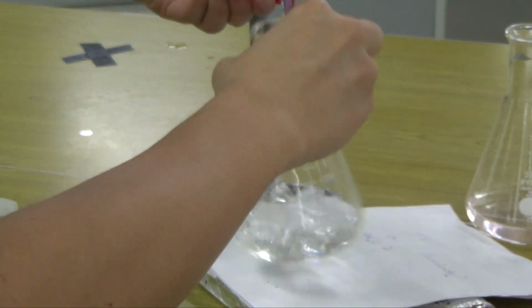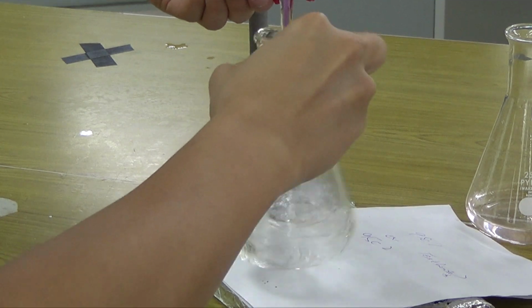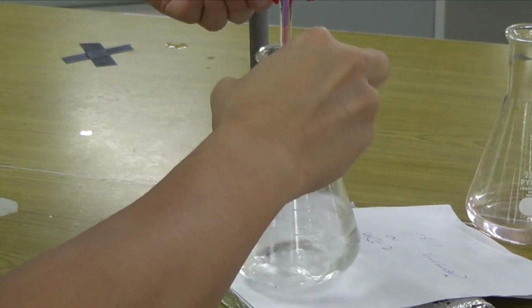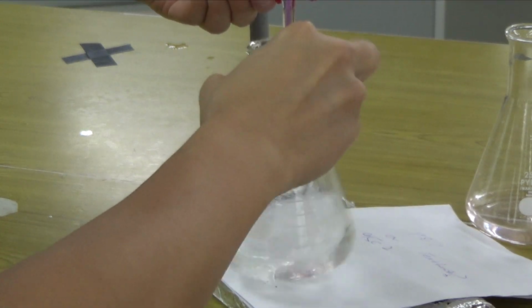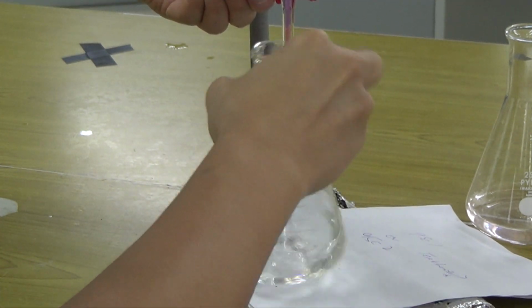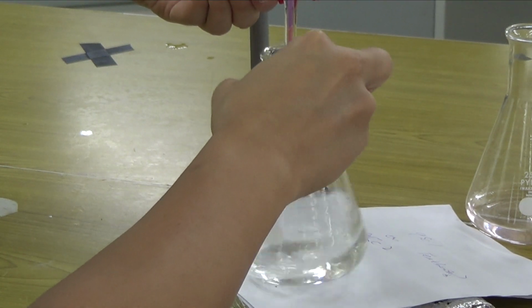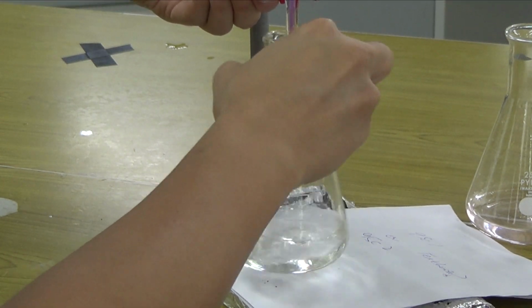And then I'm just going to swirl. I'm right-handed, so I swirl on my right, and my left is on the tap. I don't look at the volume. I never look at the volume for exact titer. I just eye focus as I swirl. My eye is focused on when it changes color. So one extra drop will give me a permanent pale pink color.